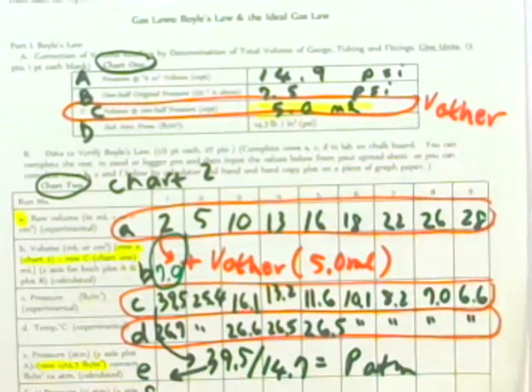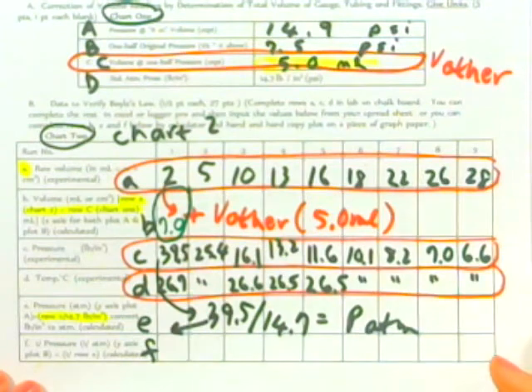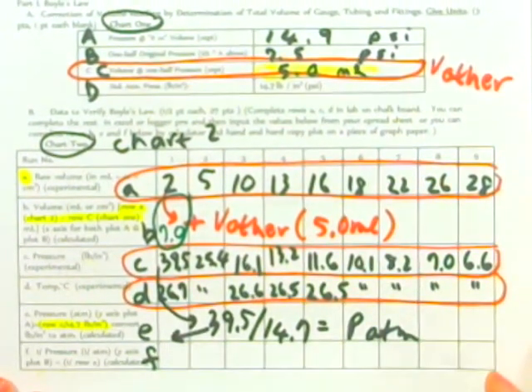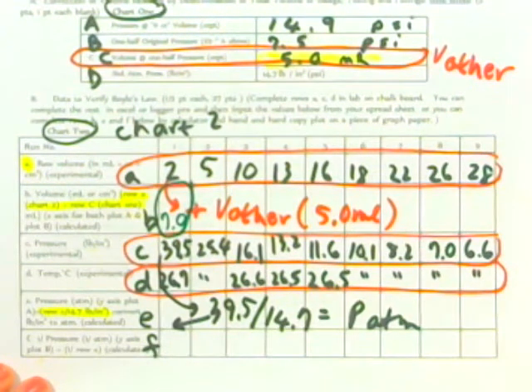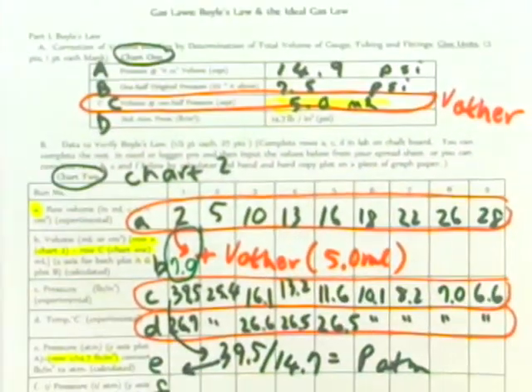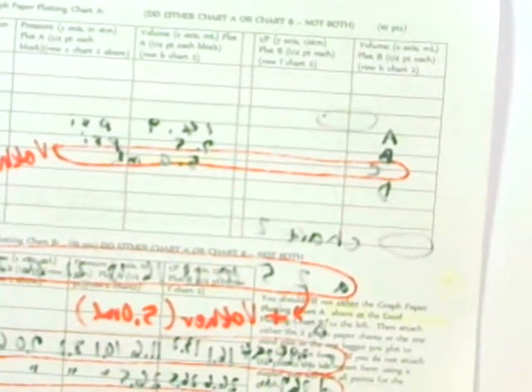And then what you're going to do is I want you to do a plot. I'm going to explain how you do the Excel spreadsheet plot in a minute. I don't mind if you do a plot by using either Excel spreadsheet, or if you do the plot by hard copy graph plotting. I don't really care what method you use to do your plot, as long as you do have a plot. So you're expected to come up with a plot. So let's look at the next part of the LabPart form. So this is page 2 of your LabPart form.